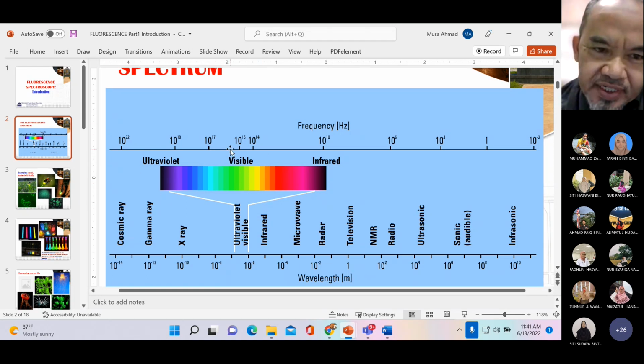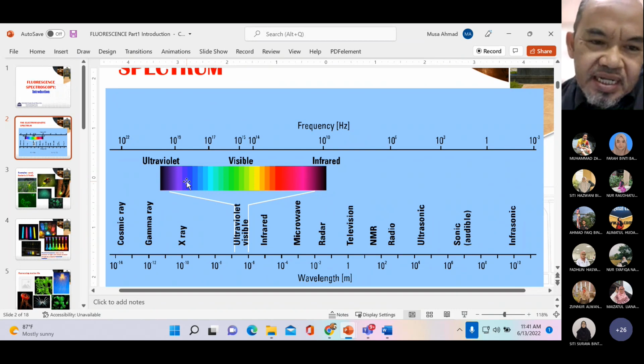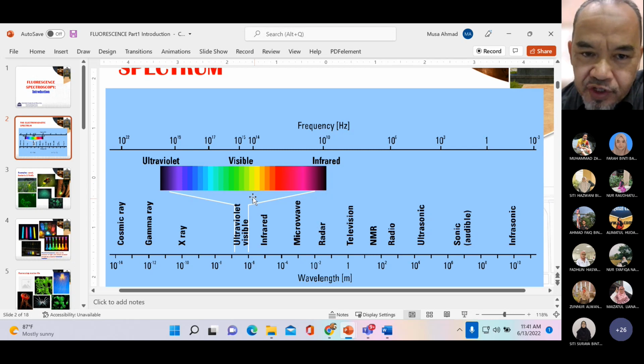And similarly in fluorescence, we also going to work still in the same region. Okay, kalau UV visible spectroscopy, actually we work in the UV and visible seperti nama dia. In fluorescence, we are still working in the same region as well. Okay, UV and visible. Alright. So makna excitation tu kebanyakan akan guna UV lah. Okay, because UV ni dia punya tenaga lebih tinggi, compared to visible. Alright.